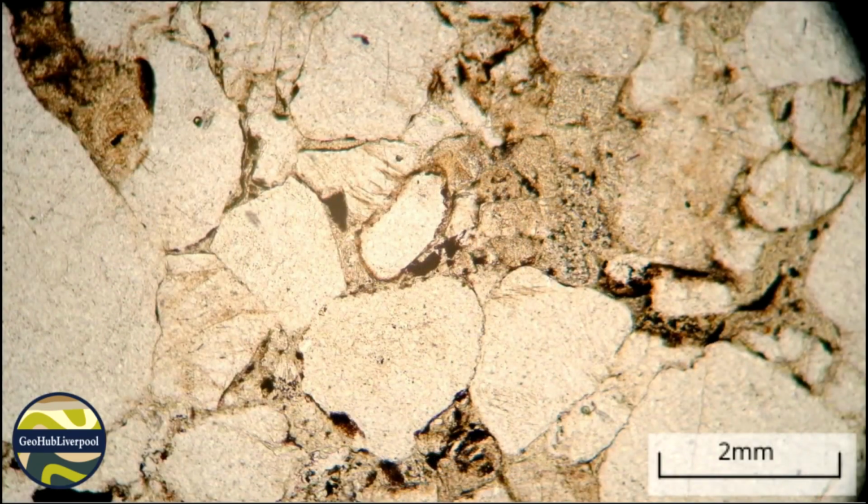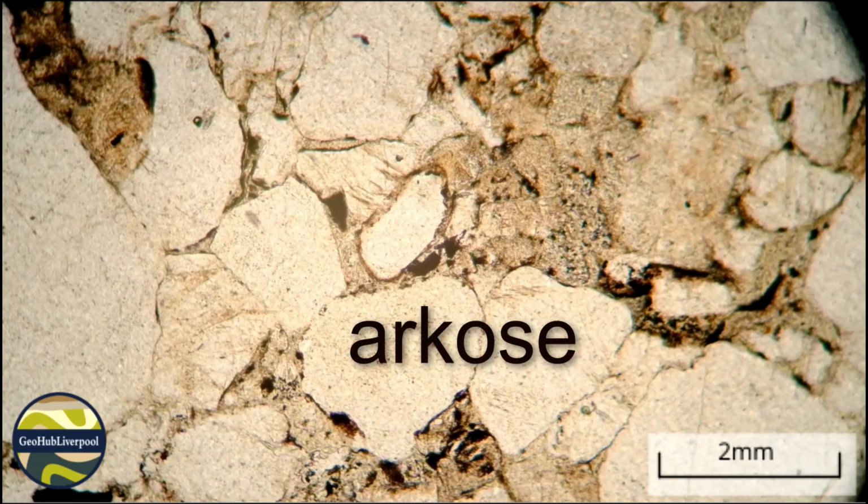In summary, this rock is a coarse-grained, poorly sorted sandstone that is texturally and mineralogically immature. It is texturally immature because it is poorly sorted and is composed of sub-rounded to subangular grains. It is mineralogically immature because it has a high percentage of feldspar. More than 25% of the grains are feldspar, which means that this sandstone can be called arkose.